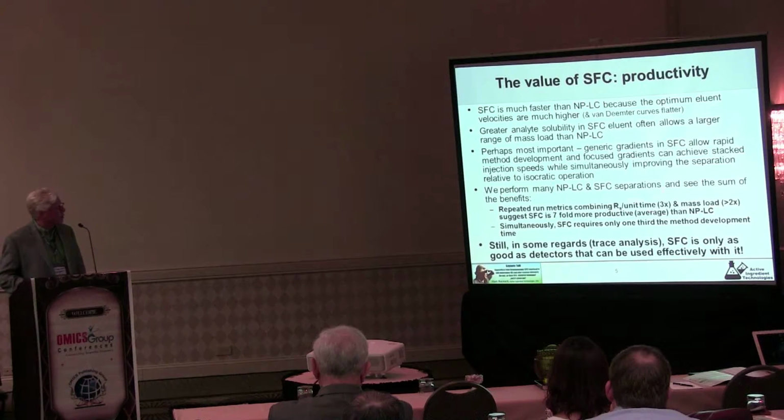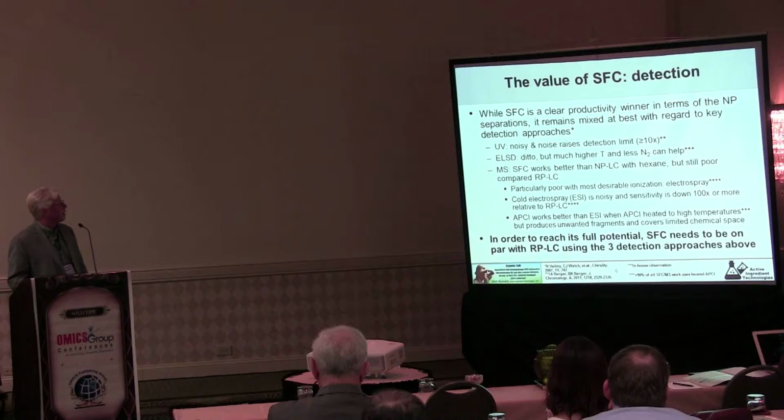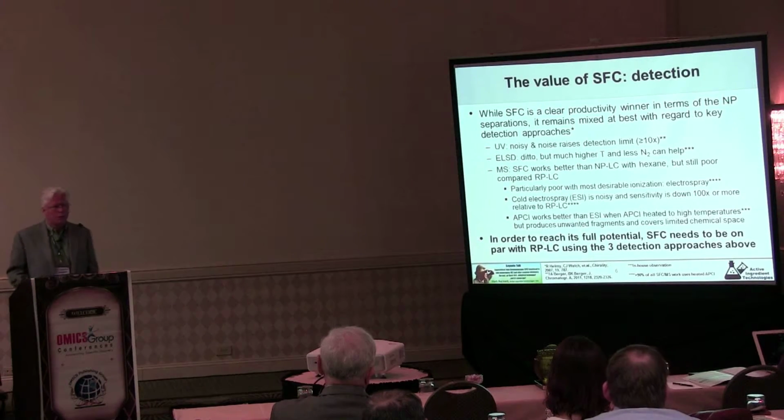So despite these productivity gains, SFC is only as good as the detectors that can be used effectively with it. So we may get great separations, but if the detector holds us back, we're still not all that productive. The issues with the detection: UV has been noisy, which raises the detection limit. ELSD, people have struggled there too. Mass spec, while for SFC it works a little bit better than with hexane solvent in HPLC, it's nowhere close to what you get on a routine basis doing reverse phase LC-MS.